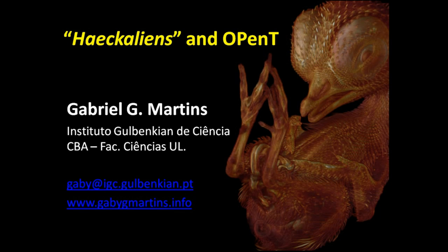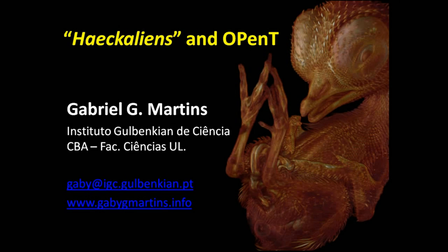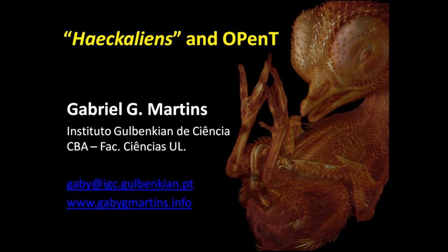It's quite fascinating to see how they develop over time, how they change in shape, and how they come to be the organisms that we later recognize as adults. But most developmental biologists, because of limitations of the optical microscopy itself, have not had access to 3D images with a lot of detail of the later stages of embryos.